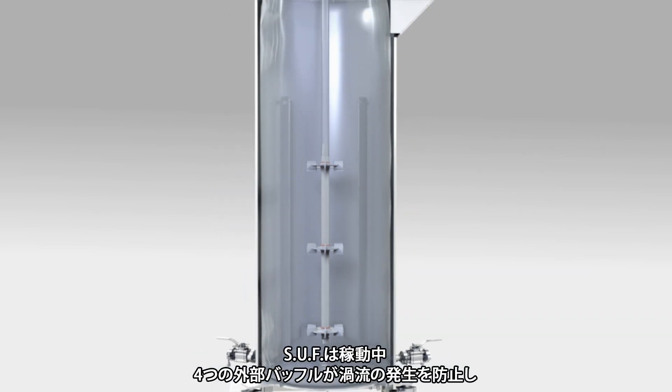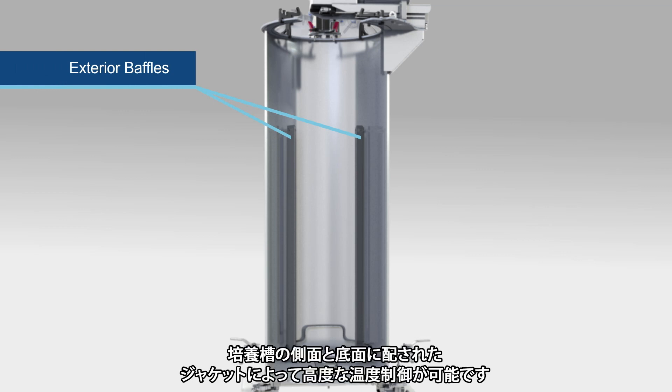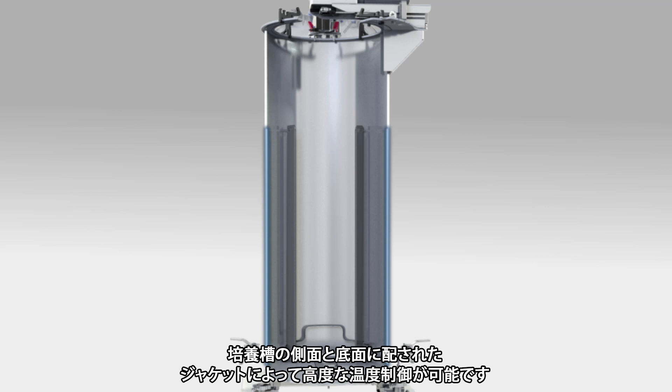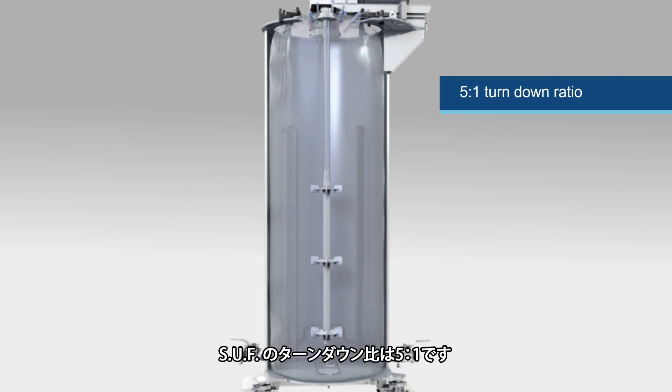Powerful mixing comes from a top-driven vertical impeller assembly utilizing multiple Rushton impellers and baffles. During operation, 4 exterior baffles prevent liquid vortexing and the vessel jacket supports advanced temperature control through the side and bottom jacketed vessel.